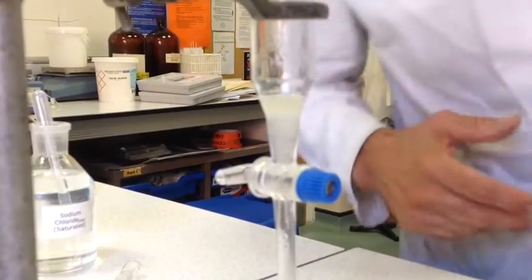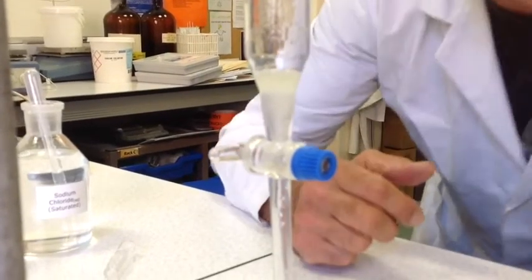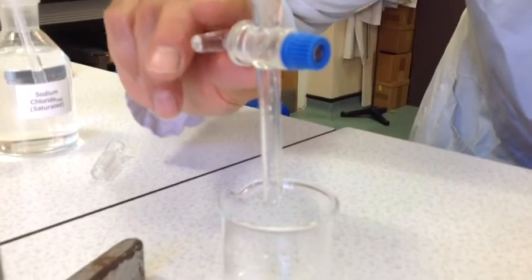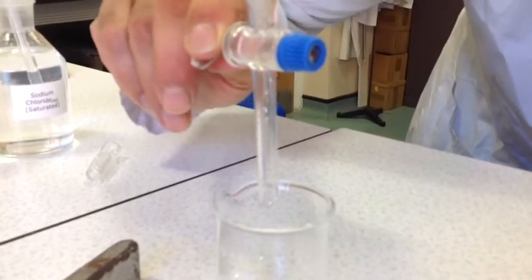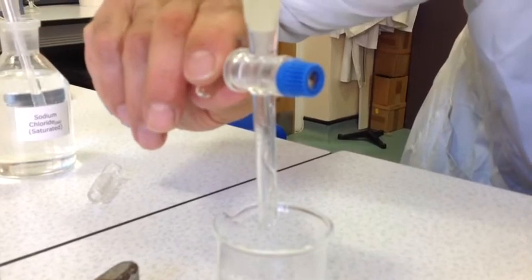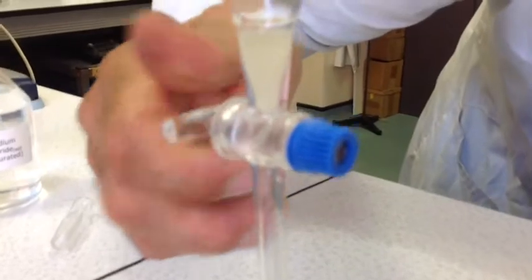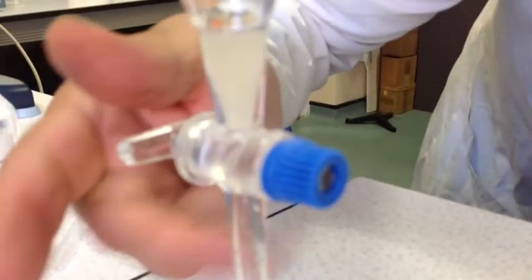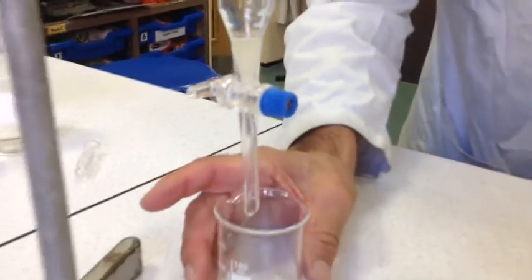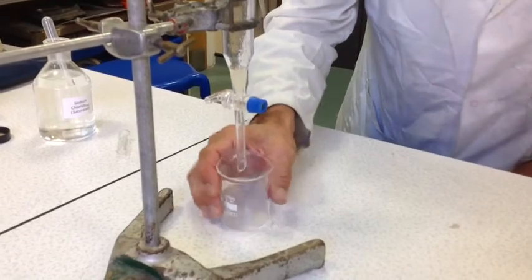Okay, when you're happy that it has separated out, we are then once again going to run off the aqueous phase from the bottom into the beaker below. So again, do this gently, slowly, and as the interface approaches the tap, we stop. Okay. The lower layer can be discarded, we don't need that. And we are going to keep the upper layer and transfer this to a conical flask.